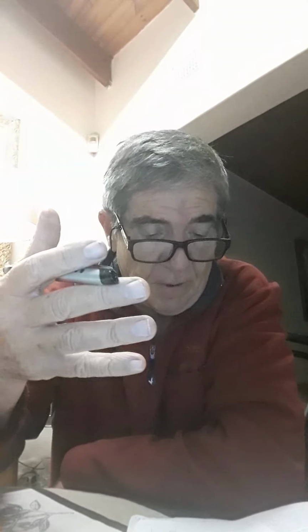Also, you will find a figure for you, figure 25.1 on page 105, where they show you that inside the test tube is a Durham tube. That Durham tube is also filled with the broth. Remember, in these test tubes is glucose broth or a sucrose broth or a lactose broth, different types of carbohydrates. And that Durham tube is a small test tube that we put inside upside down, and it is also filled with the broth.